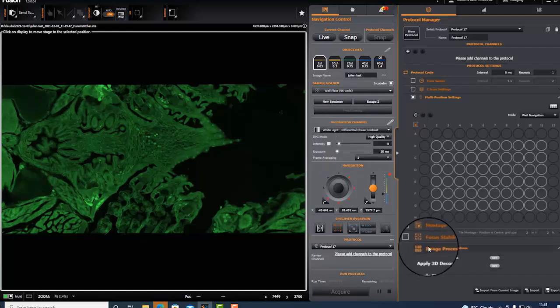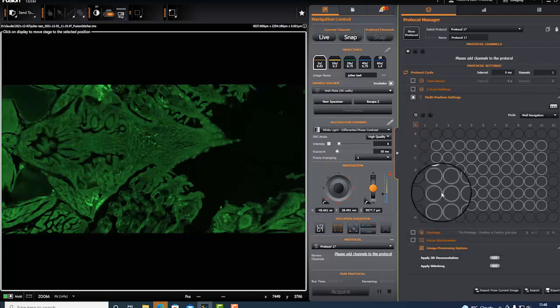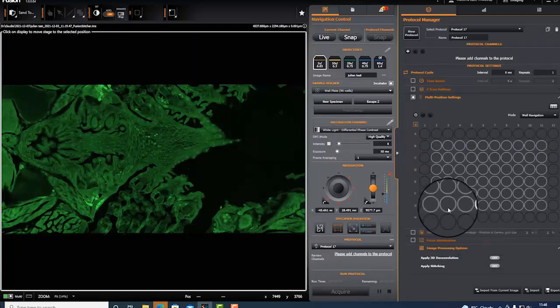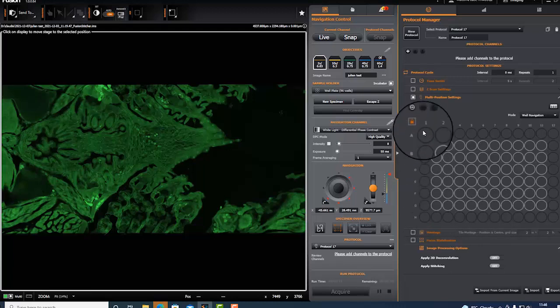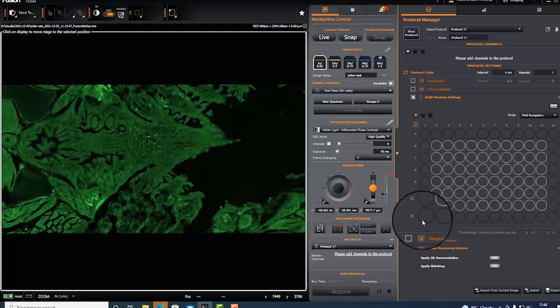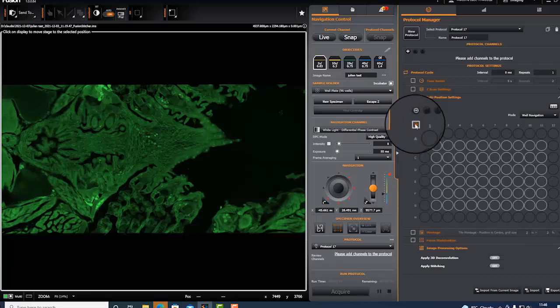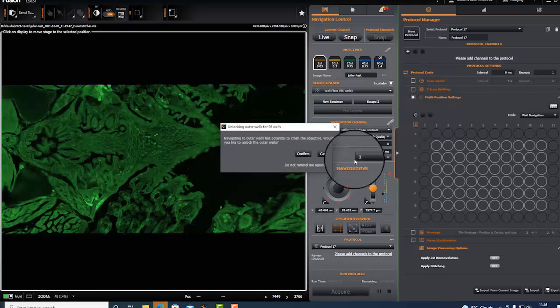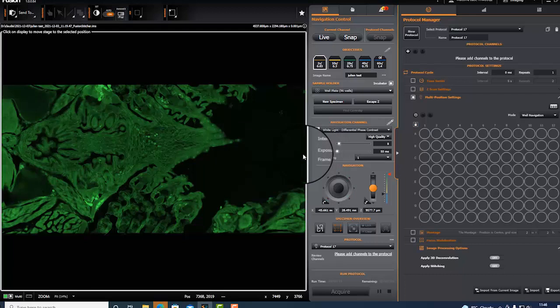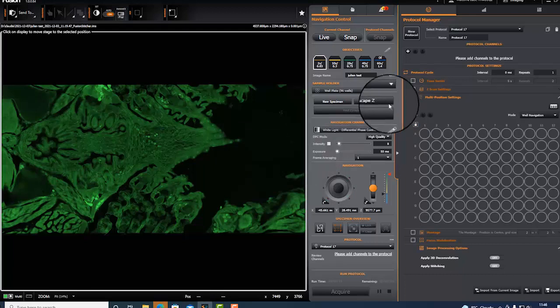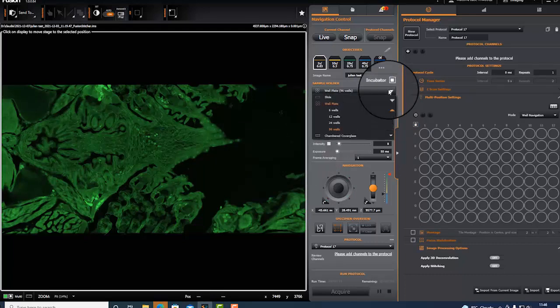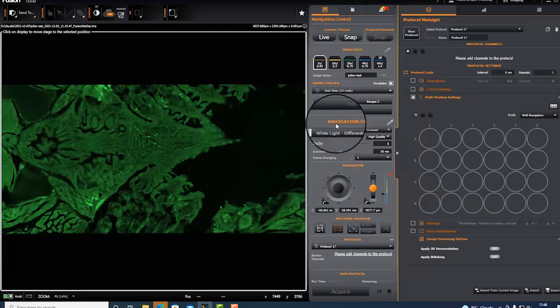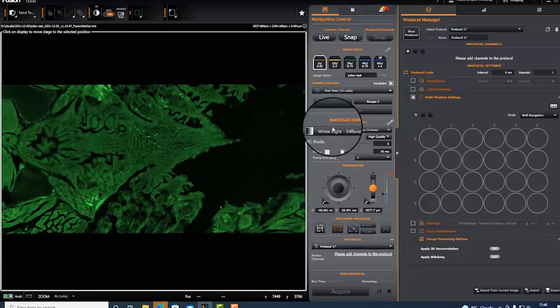Before that, just letting you know if you're using a 96 well plate, the exterior part of the 96 well plate is locked. If you want to use the full 96 well plate you need to unlock and confirm that you want to unlock.